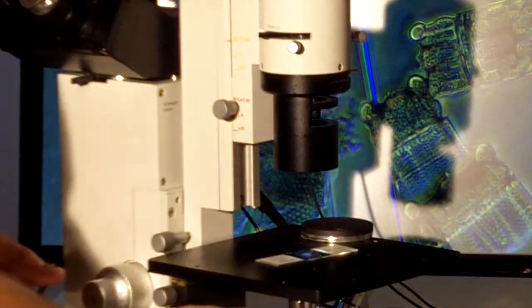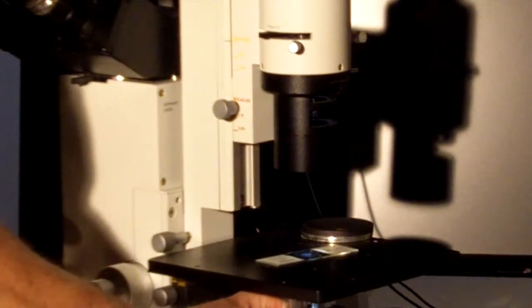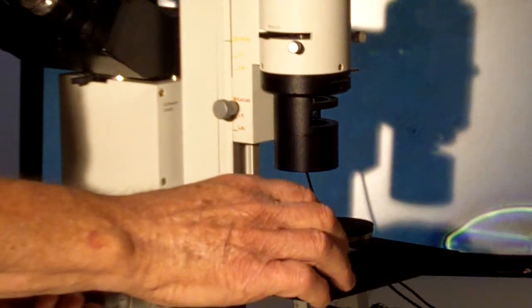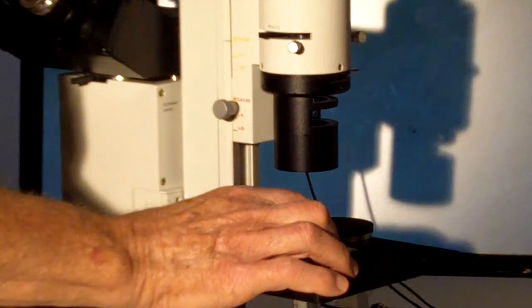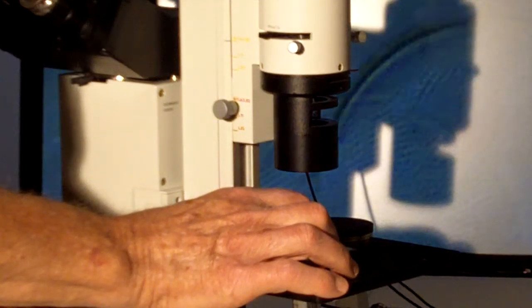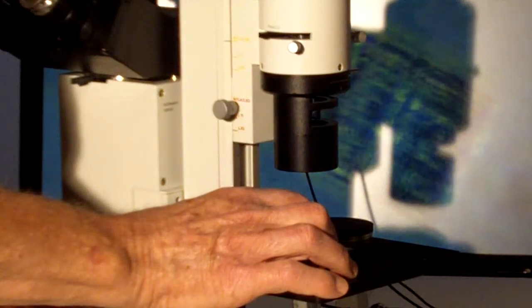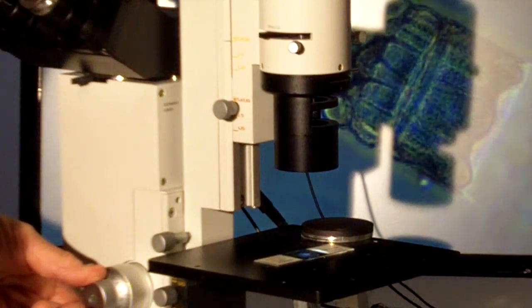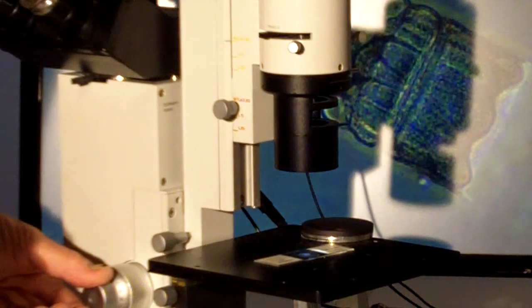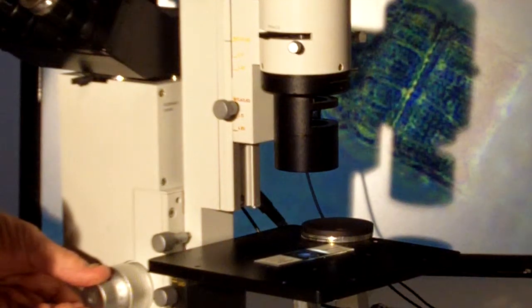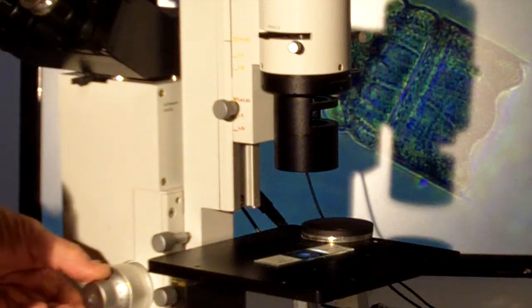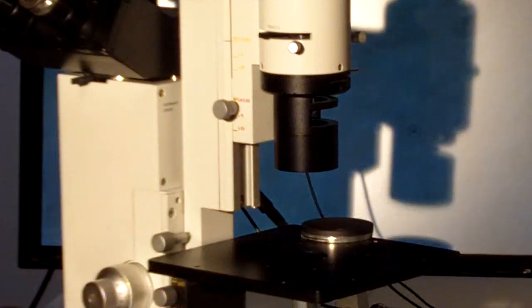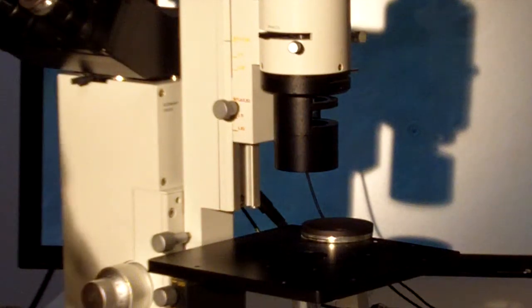Let's go to a larger structure. Beautiful little structures. Then we can go to a 32x objective that really would be difficult to replicate on an upright phase contrast microscope.